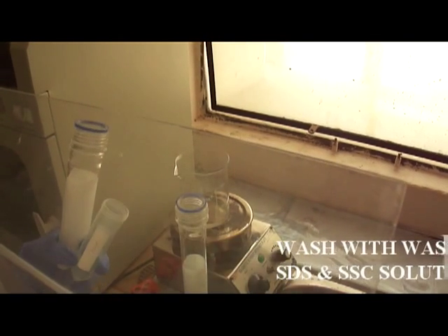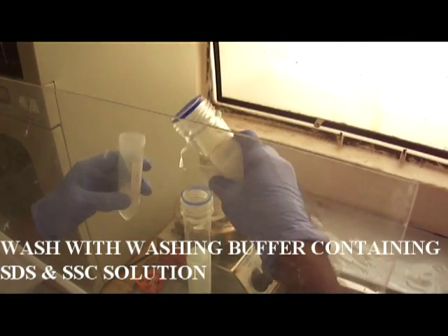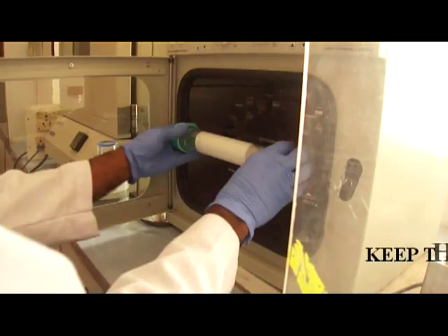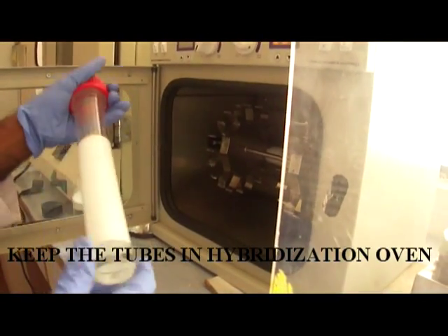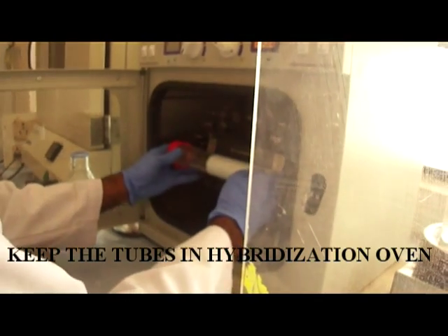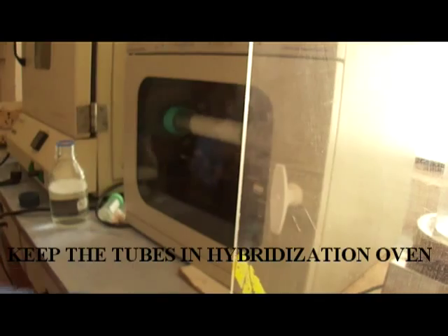Then remove the radioactive probe solution and wash the membrane using a washing solution containing 2x SSC and 0.1% SDS. Then keep the tube in the hybridization oven for spinning. Washing is done for 15 minutes, which is performed two times.